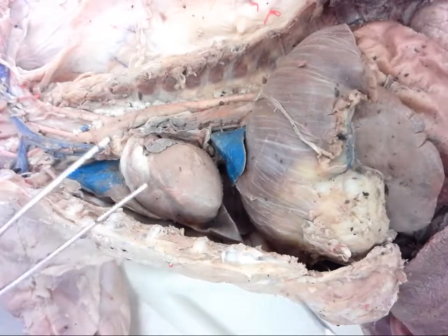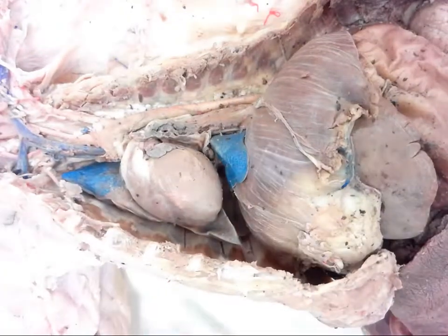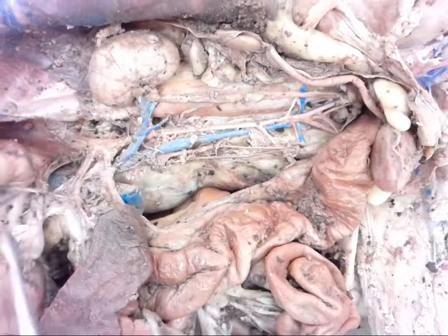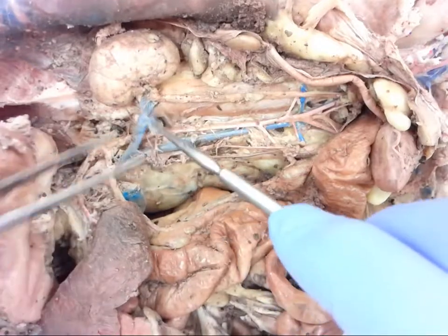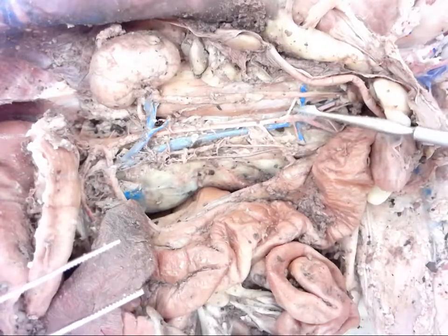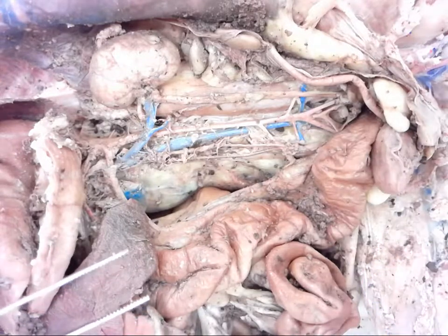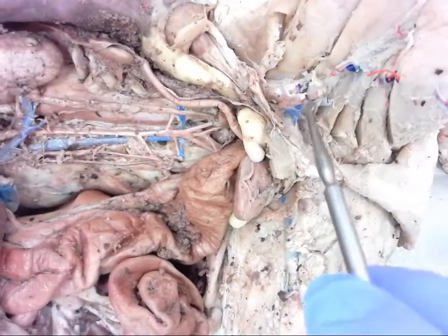as it brings all of that blood flow back to the heart. So again, quick review: aorta, aortic arch, descending aorta. We go down past the diaphragm. We have the celiac trunk, superior mesenteric, the renal artery, the inferior mesenteric, our iliolumbar, and then our external and internal iliacs feeding into, external is going to feed into the femoral artery down here in the leg.